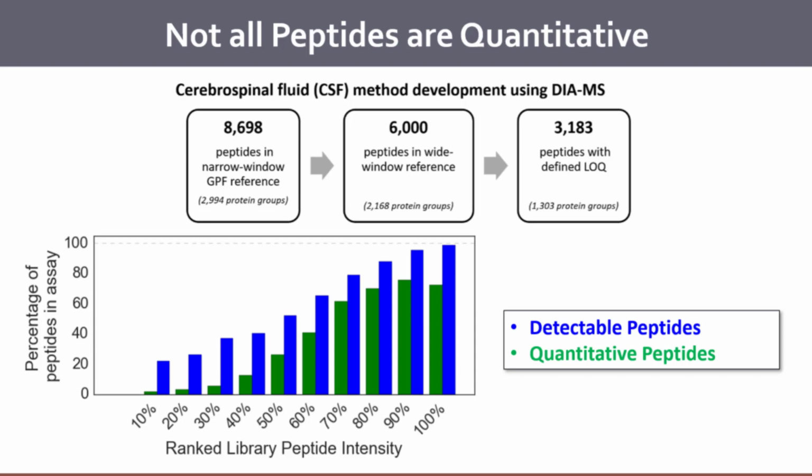So this is actually a little bit disappointing. It's not saying that you can't use these ones to make differential measurements, but the ones where the change in signal will probably reflect the change in quantity are only going to be a smaller subset of the individual peptides.